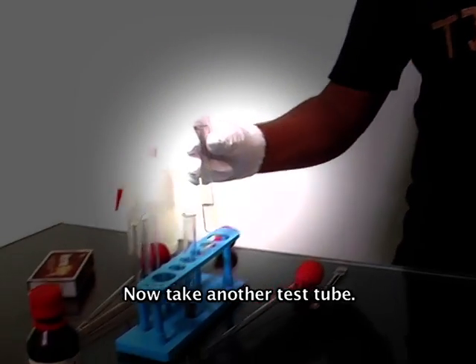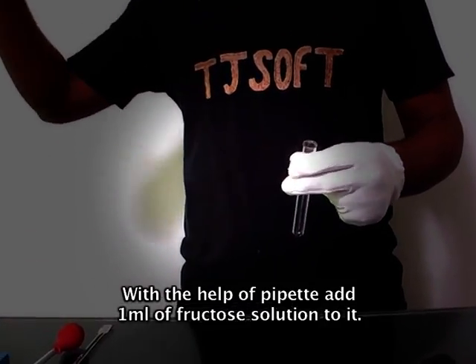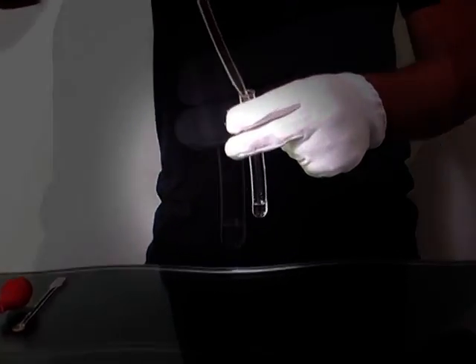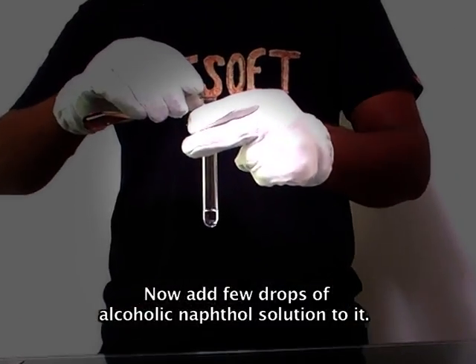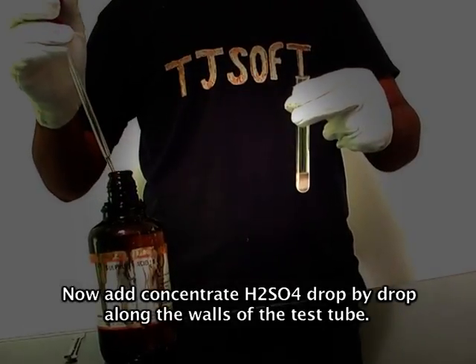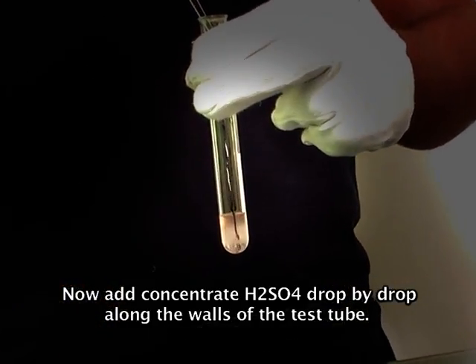Now take another test tube. With the help of a pipette, add 1 ml of fructose solution to it. Now add a few drops of alcoholic naphtol solution, then add concentrated H₂SO₄ drop by drop along the walls of the test tube.